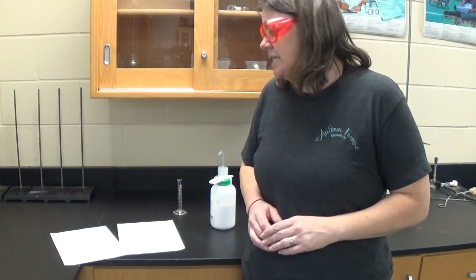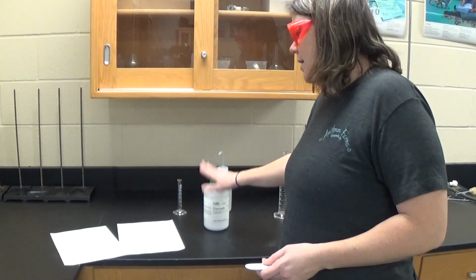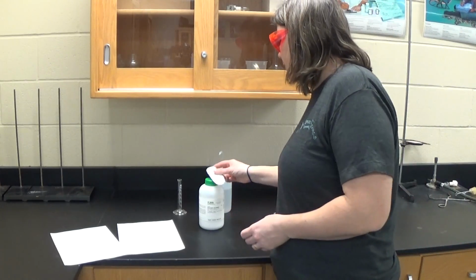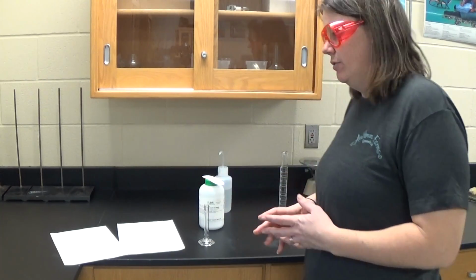Today we're going to be running the lab procedure that goes with the energy changes in physical and chemical systems. As you can see, I have all of my supplies set out here, and I make sure to have my goggles on because we've got to protect our eyeballs. And here I have my calcium chloride pellets that we will need for part A, and my distilled water, and that'll be going into this small graduated cylinder here.